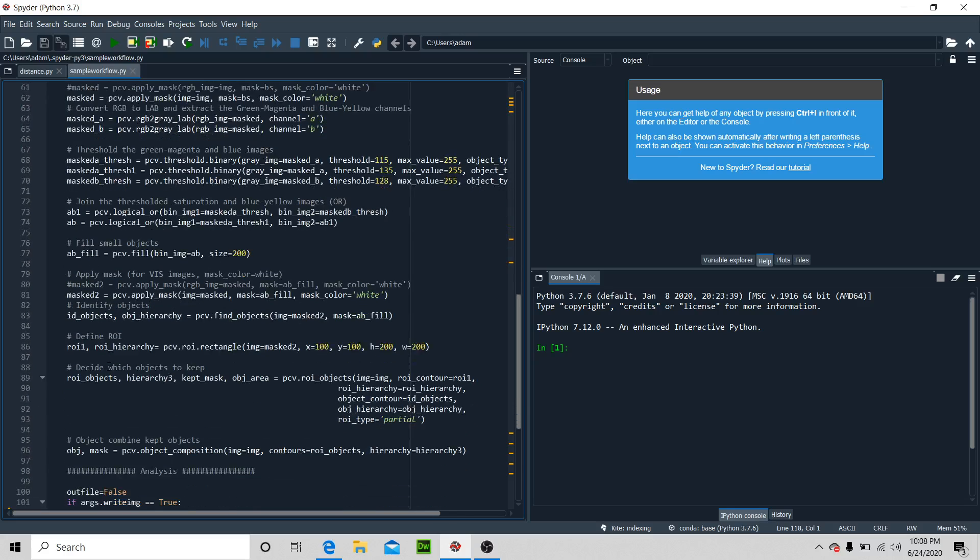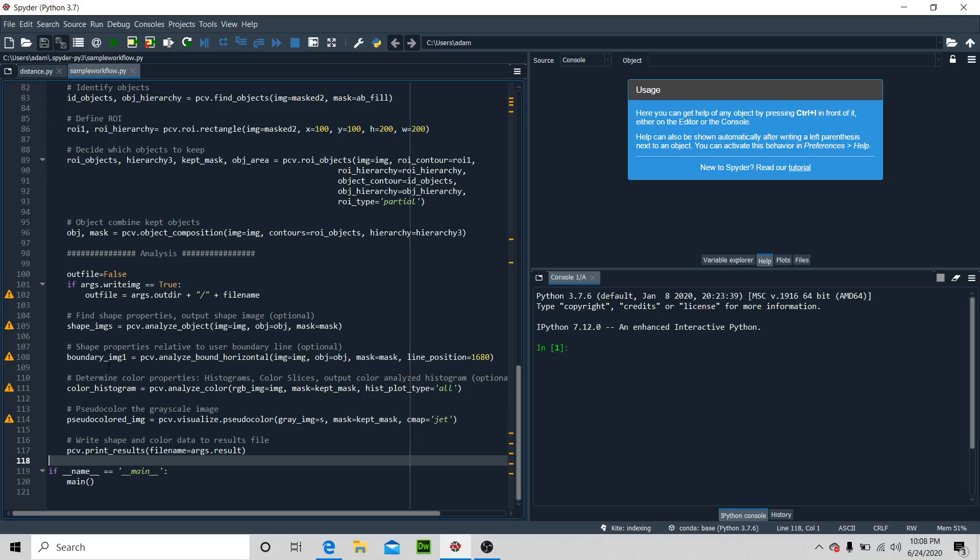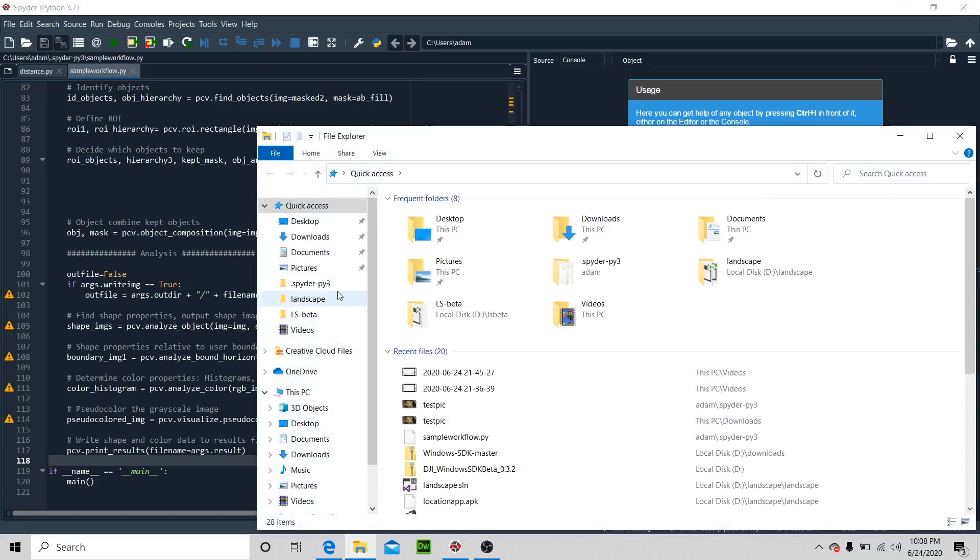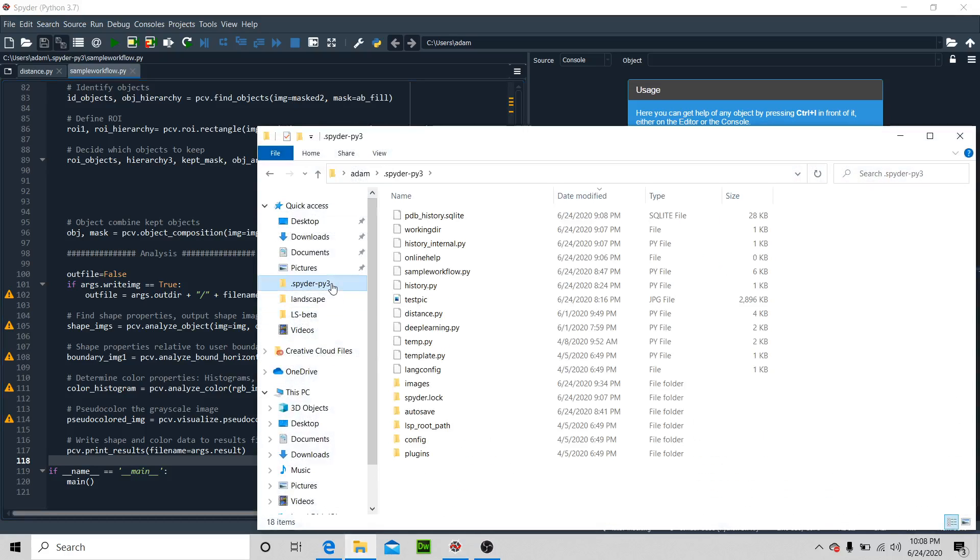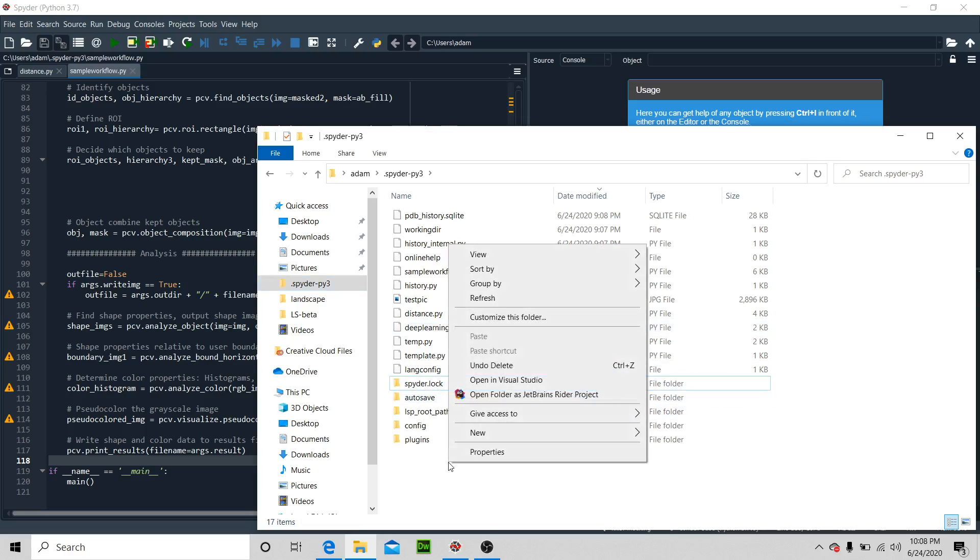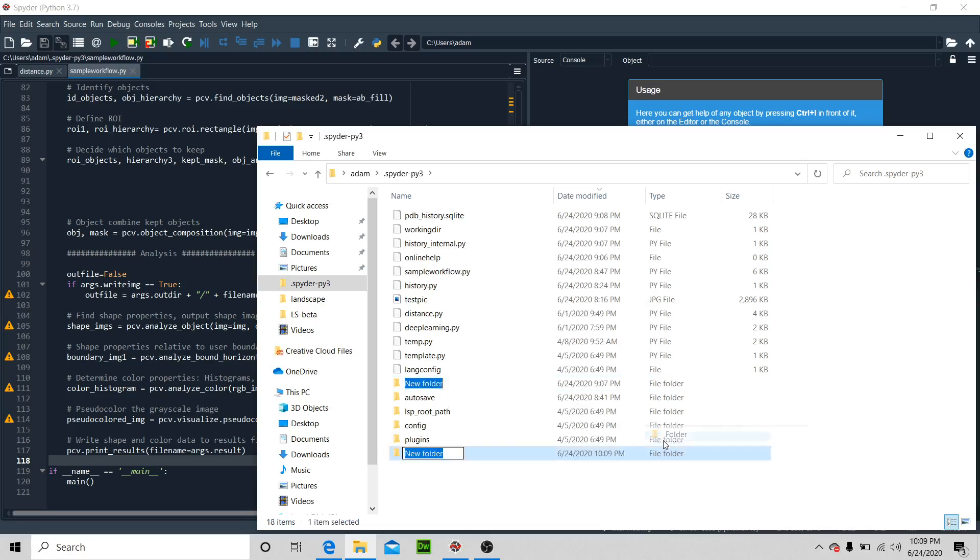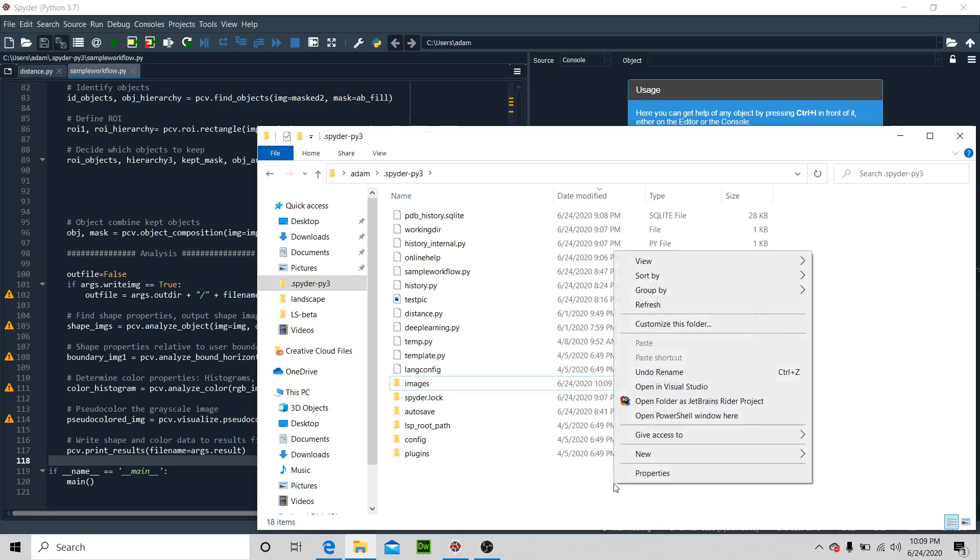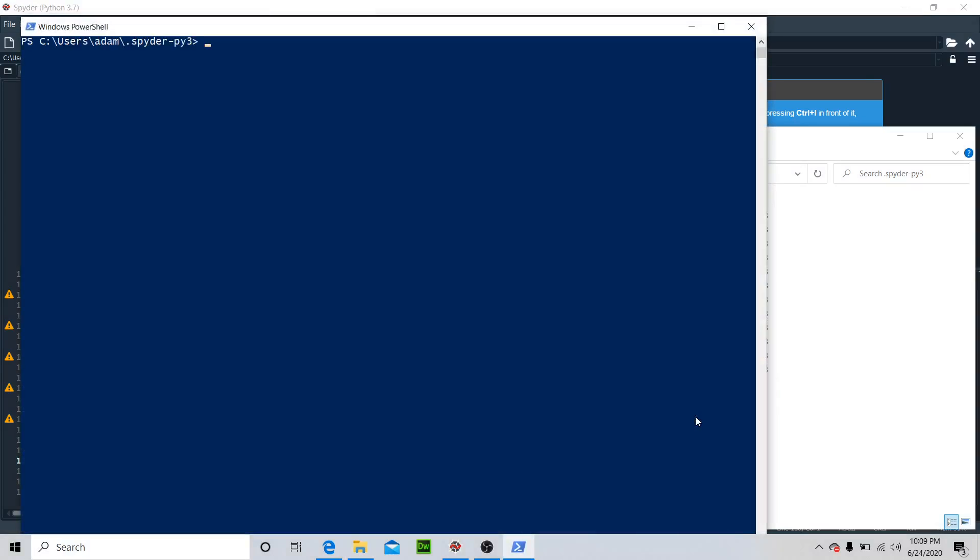All right, now if we were to run this, let's go ahead and find a directory. Let's delete that folder and create a new folder called 'images'. We're going to right-click into the PowerShell window here. I've included this example in the GitHub.